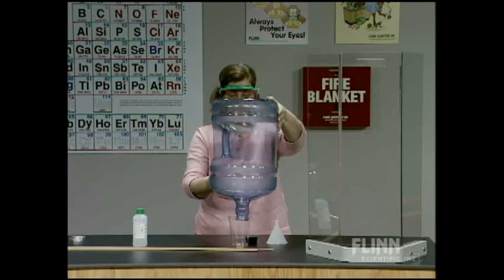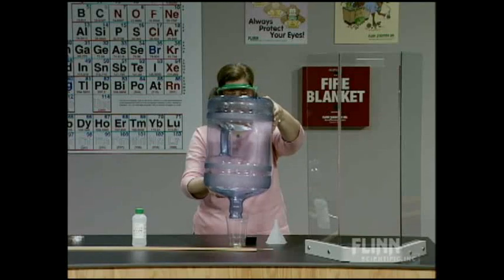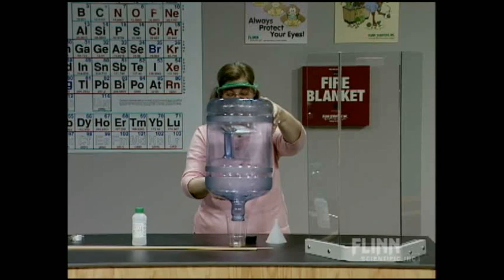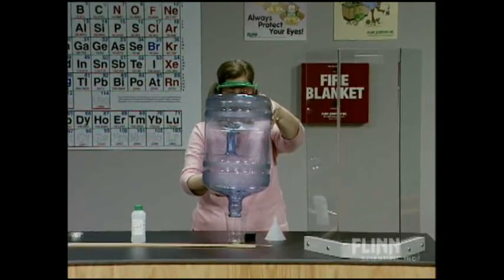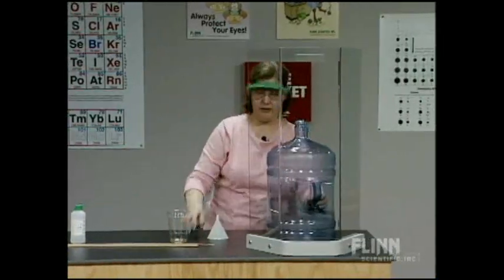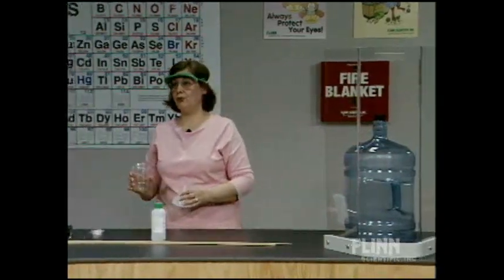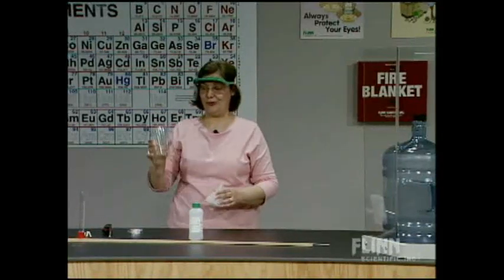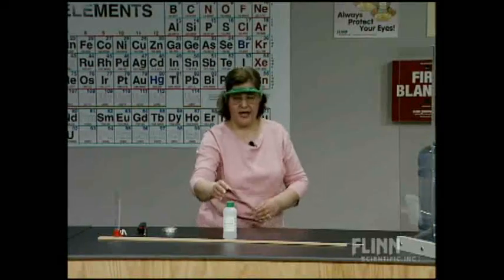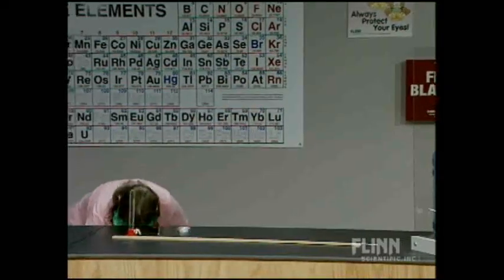It's very important if you're doing this demonstration to do it behind a safety shield — we highly recommend this, it increases the safety. Also, if you're doing this in your classroom, everybody in the audience should be wearing goggles or safety glasses as well. That looks pretty good. I'm going to put that right behind the safety shield and cap it there for just a moment so that hopefully that vapor will stay. This is the most important part of this demonstration — it's what you don't do. Make sure you don't have any liquid alcohol near the surface, and your source of alcohol far away from the demonstration as well.